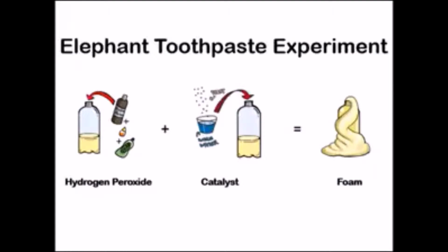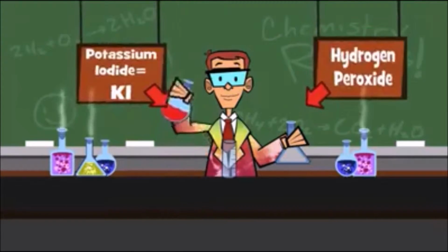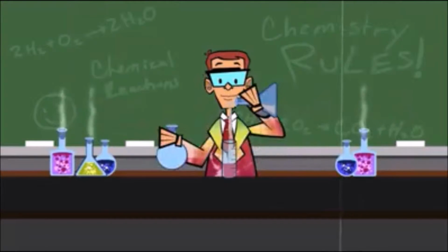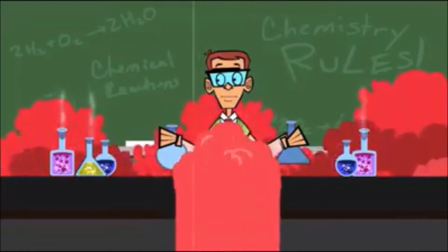Elephant toothpaste is a common experiment often performed in secondary education due to its exploding nature, its fast rate of reaction, and colorful appearance. The experiment is thoroughly engaging and demonstrates basic chemistry of reactions and what a catalyst does in a reaction. The name elephant toothpaste was given to the experiment due to the stream of bubbles that pour from the flask or tube in the experiment.